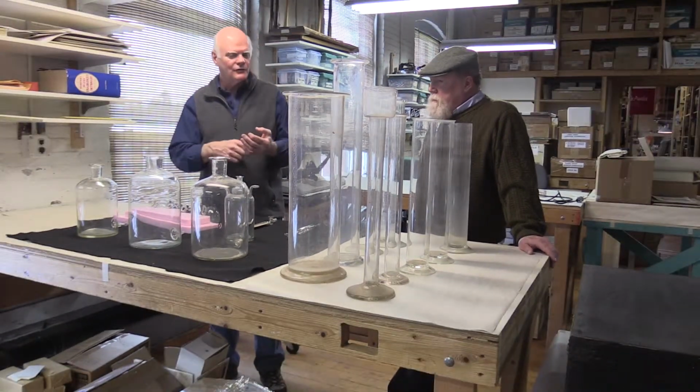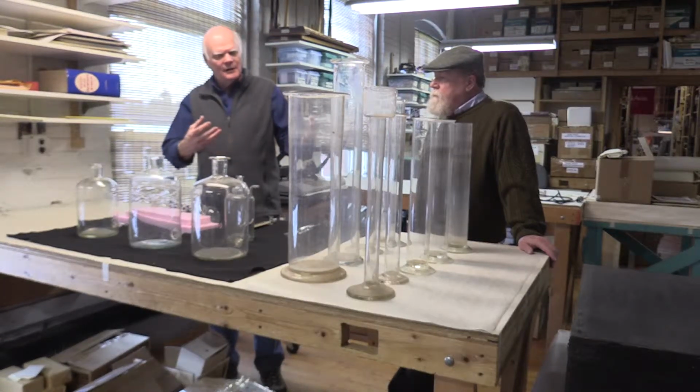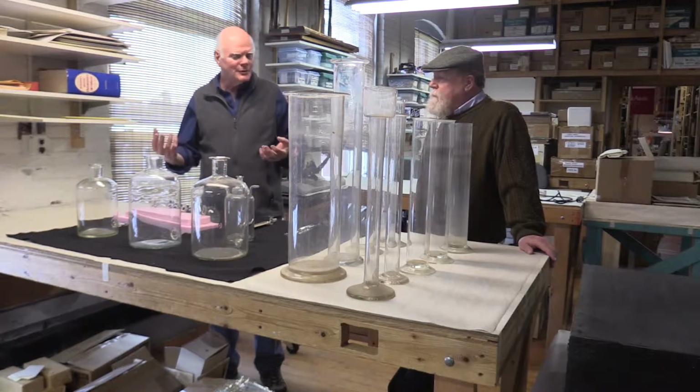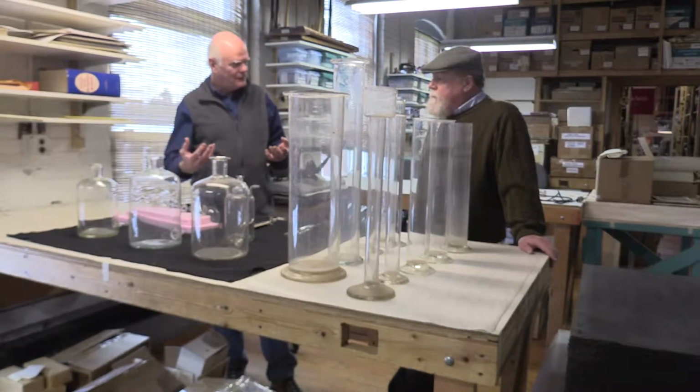You know, what was interesting? Was organic chemistry being developed? Was it physical chemistry? Was it just analysis of mineral samples? I've got pieces of equipment, polarimeters, that were developed because of tax regulations.